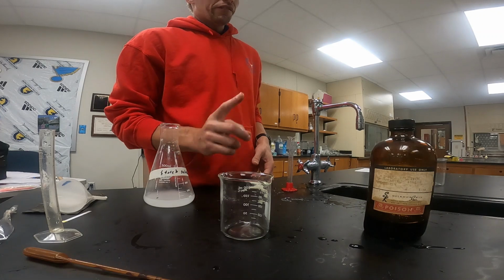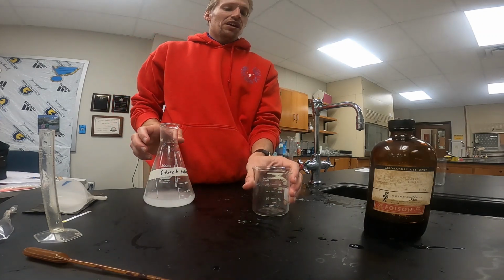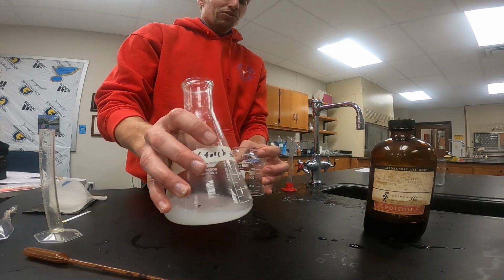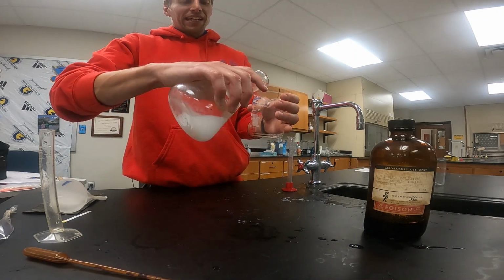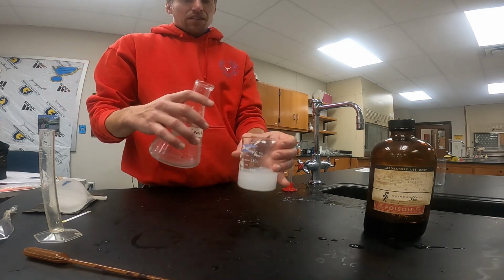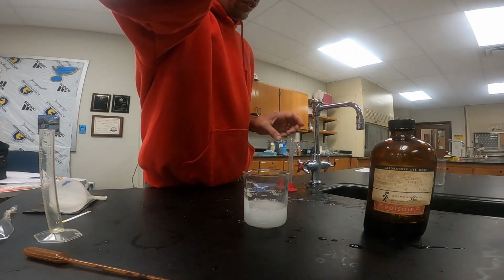While we let our first dialysis balloon sit in the solution, we'll set up our experiment part B. In this part, we're going to use 100 milliliters of that same starch solution. So I'm going to pour that up to, again, it doesn't have to be exact, about that 100 milliliter mark. And we have 100 milliliters of our starch solution.